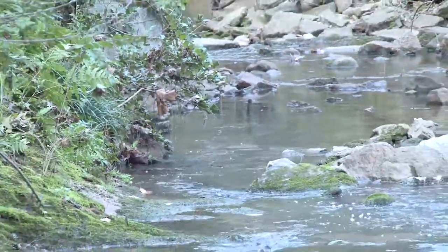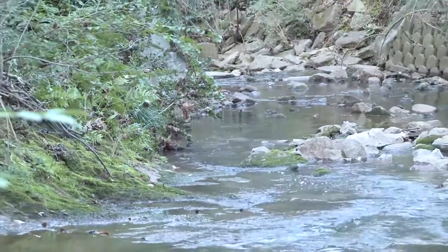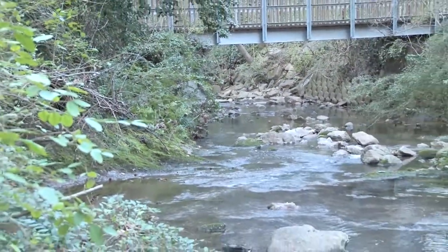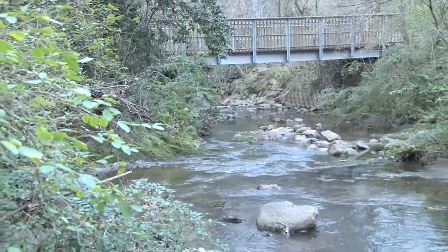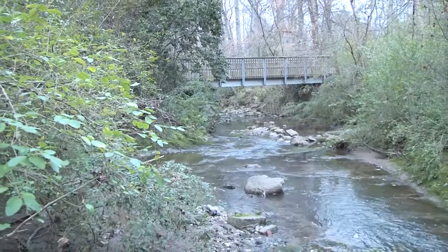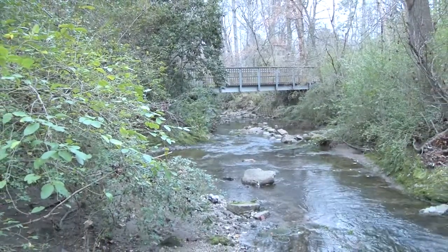Here we are at Low Water Creek, an urban stream in Metro Atlanta. We've come here to sample for dissolved oxygen, an important indicator of the stream's ability to support biological life. A healthy stream tells us we live in a healthy watershed and a healthy environment.